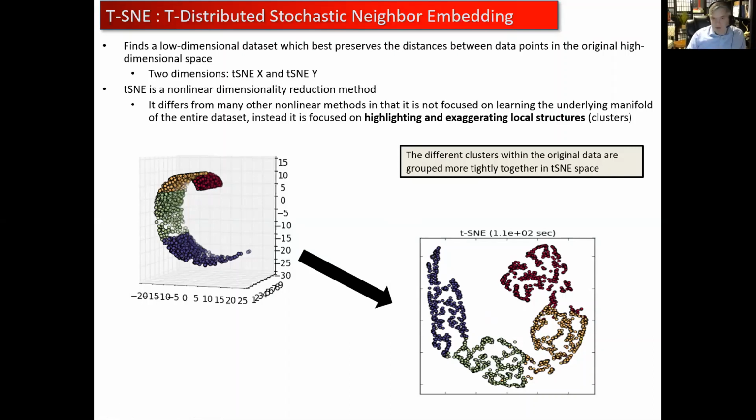Now, when you're working with flow data, you might have 4, 5, 50 dimensions, depending on how many parameters you've acquired in your data set, how many parameters you're running through the algorithm. Of course, showing a 20-dimensional data set in a Swiss roll is not so ideal. But really, that's the idea. It's going to take this high-dimensional data, however many parameters you have, and map it into some sort of 2-dimensional space. So we can go in and say, all right, here's all the things that were read. Here's where they appeared in 3-dimensional space, and we can make some sort of representation of that.